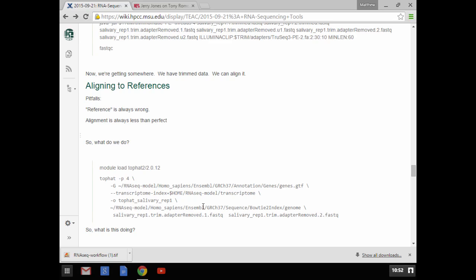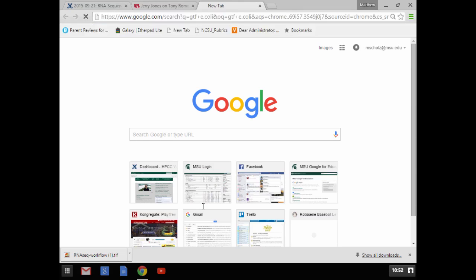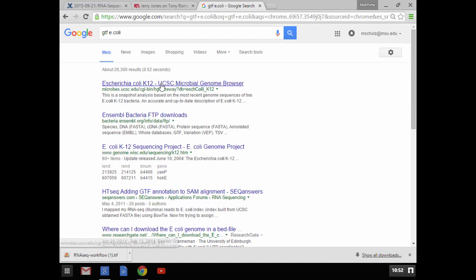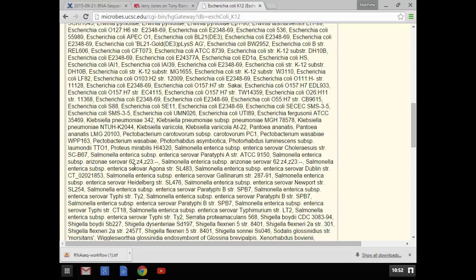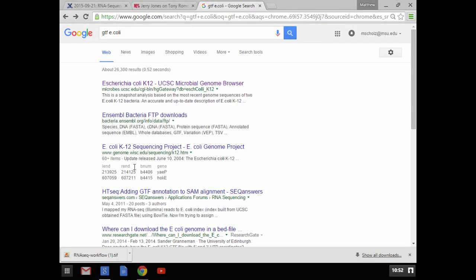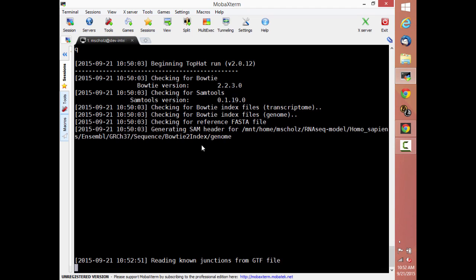So let's, here, I think I can probably pop that up relatively easily. No, this is probably not the best way to do it. I'm trying to figure out the best way to show you what it's doing here. So the alignment itself is occurring to the reference genome. Right? The reference genome is starting at base 1 and going all the way through, if you have multiple chromosomes, through each chromosome. If you have one circular chromosome, through base 0 and base -1, where they join together, and prints that whole reference, the whole chromosome.